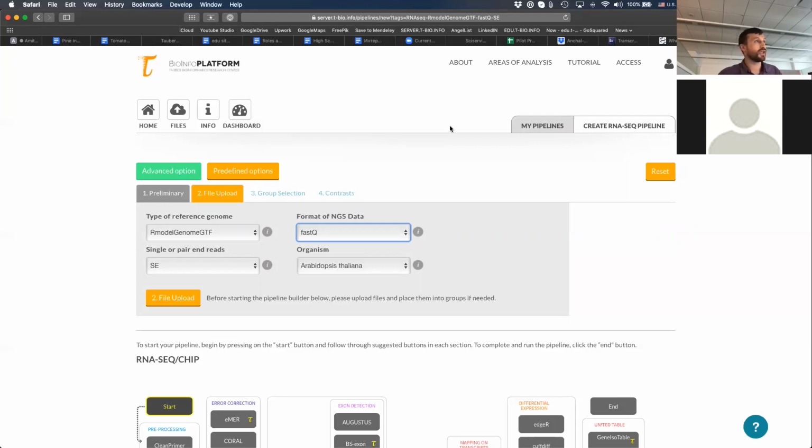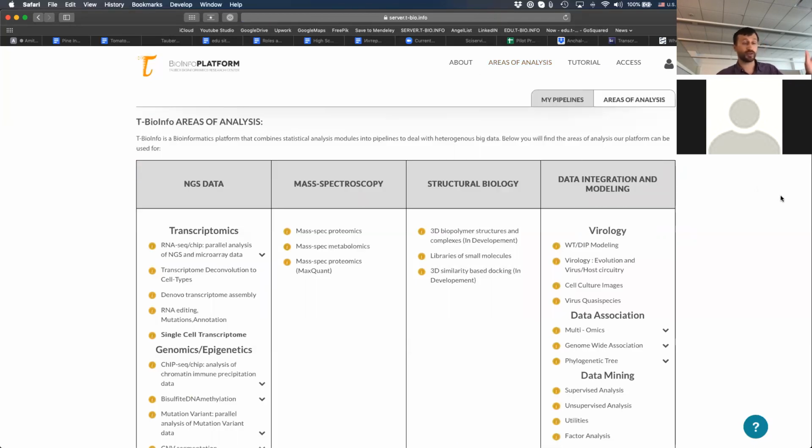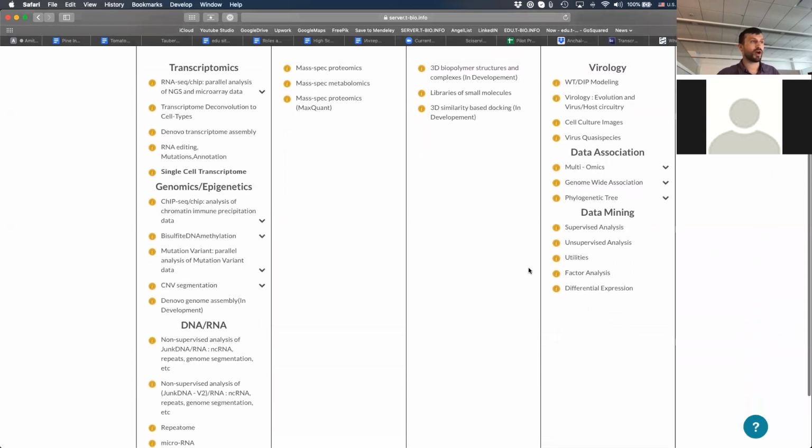In the meantime, if you do have a gene expression file, which by the way, if you go to Transcriptomics 2 or even complete Transcriptomics 1, you will be able to download gene expression data, processed data, which will be in a TXT, tab delimited format. And then you have a number of other data mining and annotation techniques here that will let you look at a statistical analysis or a machine learning algorithm or annotation of that data set using pathway analysis, for example. Does that make sense? Yes, it makes perfect sense. Thank you so much. All right, great.